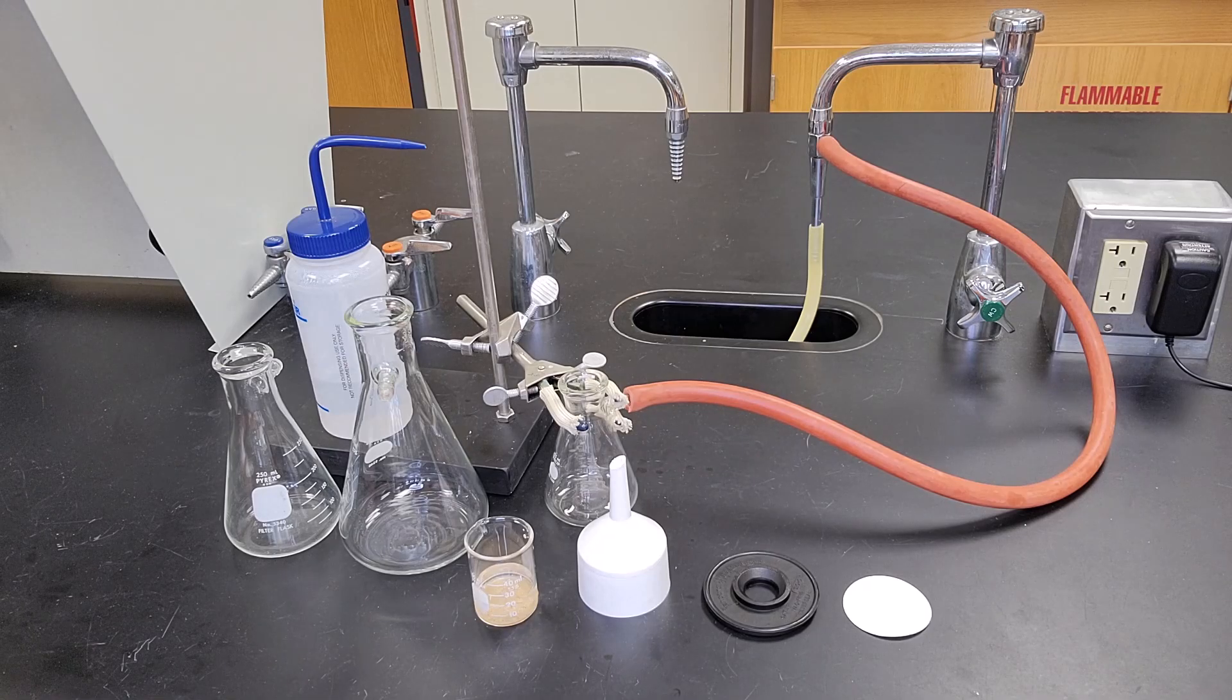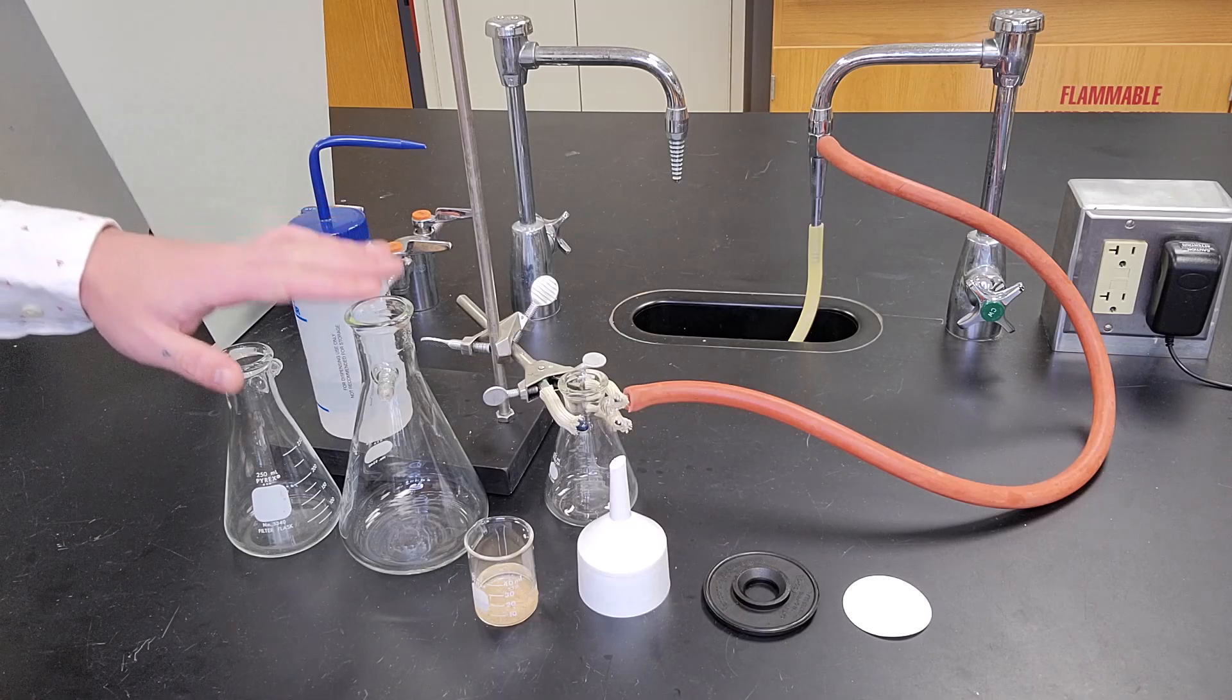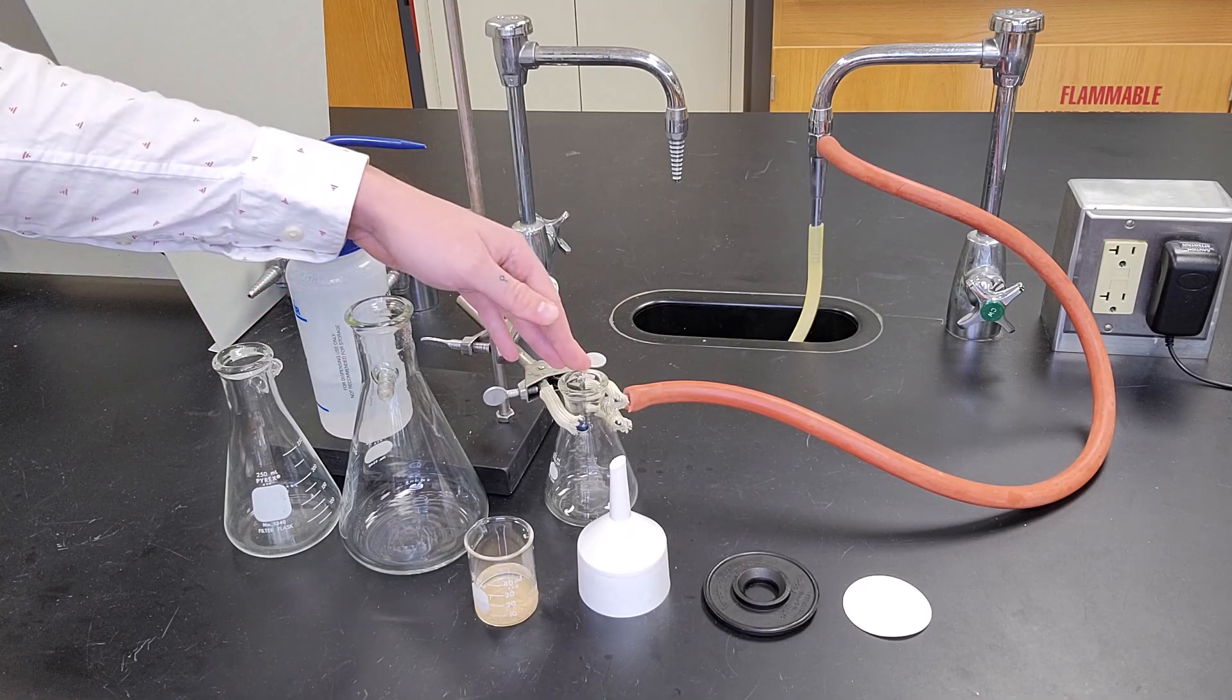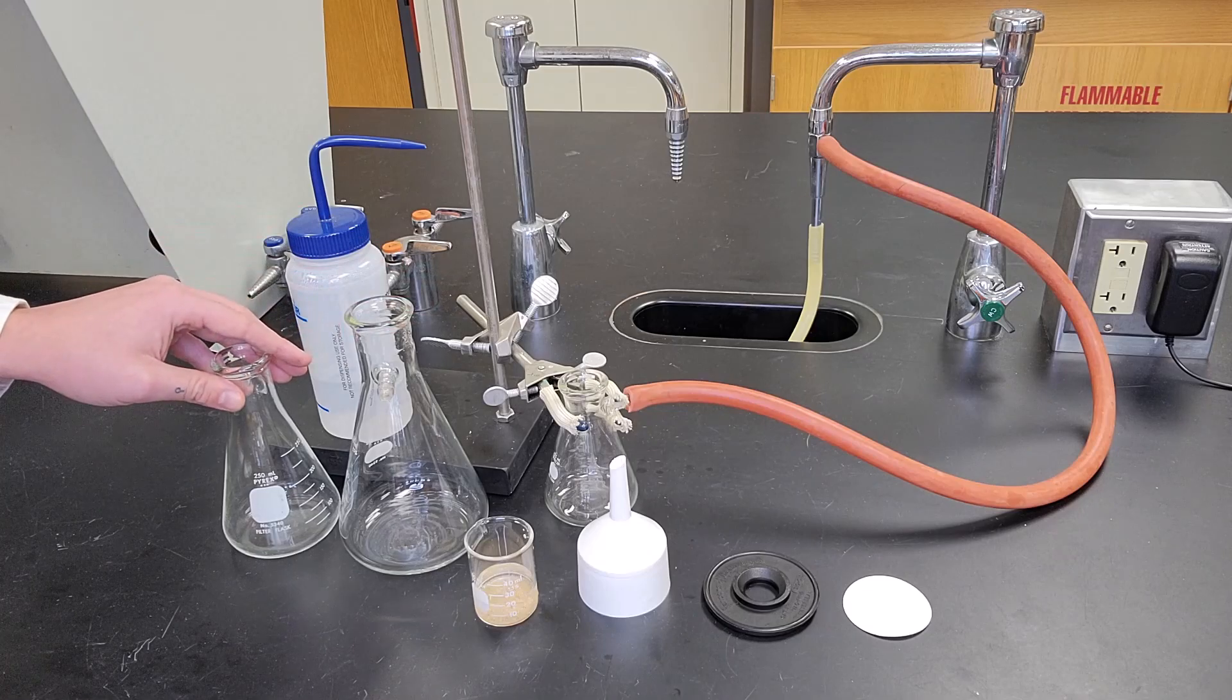There are a couple pieces to a vacuum filtration. One is the sidearm flask or sidearm Erlenmeyer flask. I have the smallest one hooked up, but they come in different sizes—we have a larger and a medium size.